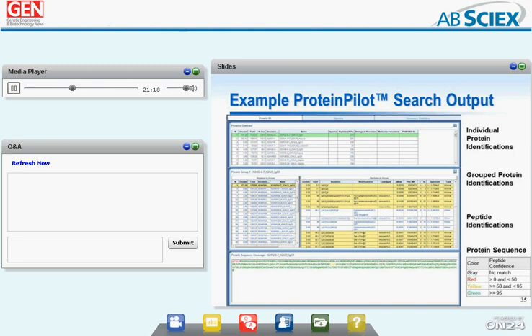So it also helps pick out protein families from your database. The middle part on the right side shows all of the individual peptide identifications that are linked to that protein identification. As you click through the list in the middle left of the screen, it highlights all of the peptides that match that specific protein and blues out ones that came from other homologous protein identifications. The bottom of the window shows the sequence alignment, and it color codes based on how likely the peptide is positively identified, with green being 95% or higher.